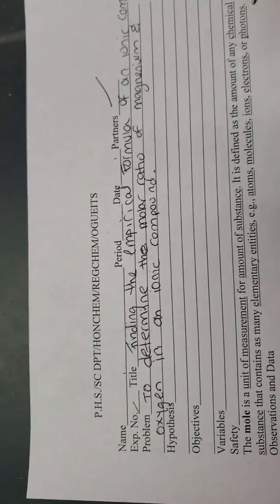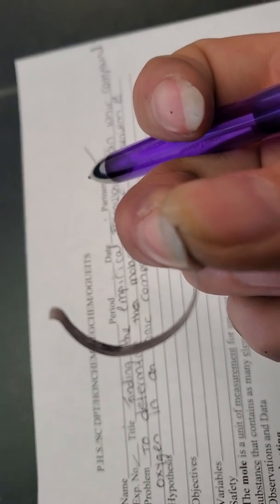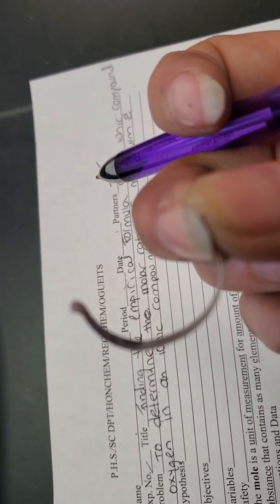Well, the question was, do you think that the mass of the magnesium initially, so if I put this on a balance and I got the mass, do you think that the mass is going to increase, decrease, or stay the same after you burn it?